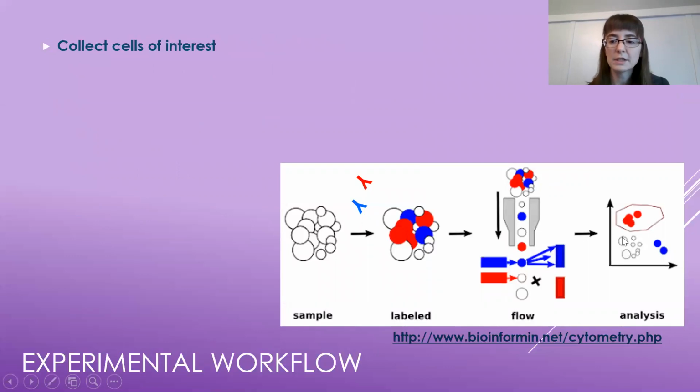All right, so what does it look like to perform a flow cytometry experiment in the lab? You have to start by collecting your sample, the cells.